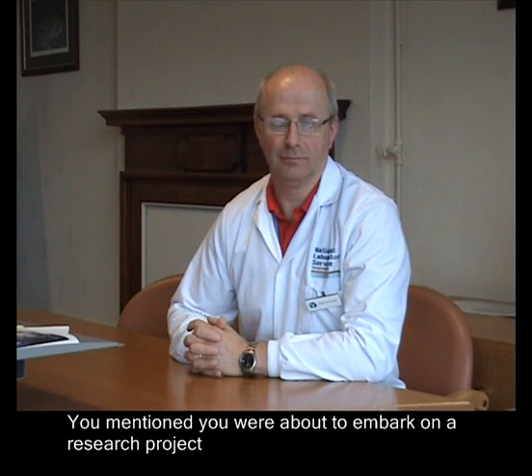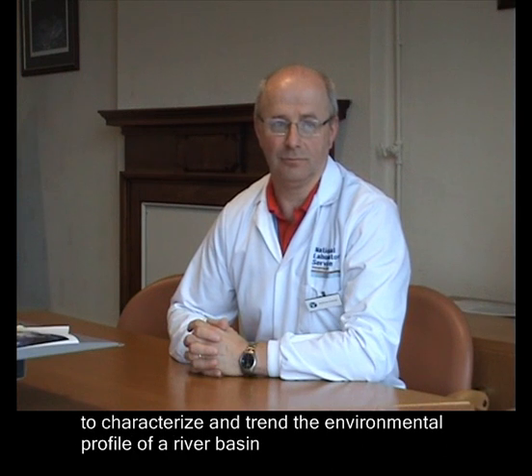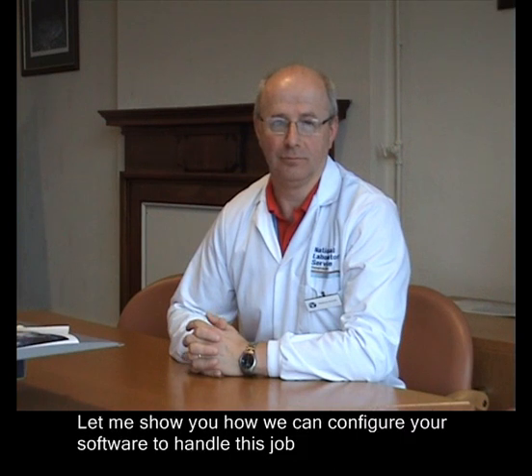You mentioned you're about to embark on a research project to characterise and trend the environmental profile of a river basin using GCMS and LCMS. Let me show you how we can configure your software to handle this job.